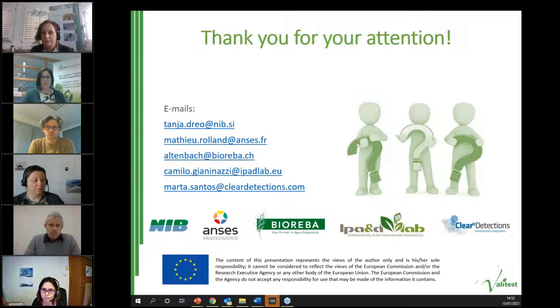Hi, good afternoon. Thank you for your question. I do not know this by heart, but I can for sure send it to you. But I know that you can detect one nematode in your sample. That is for sure. With the whole processing of the sample, you can even detect a fraction of a nematode, which is unrealistic, of course. But at least one nematode, if there is one nematode, it will be picked up. I hope this answers.